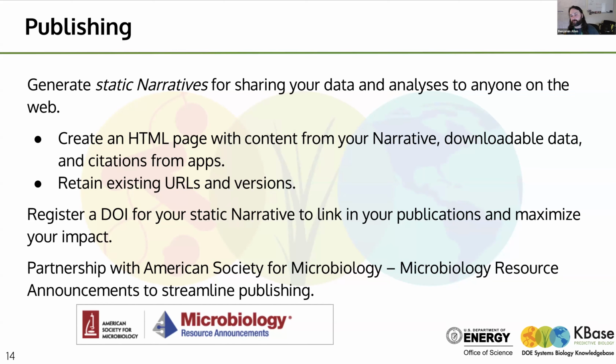And you can also register a DOI for your static narrative. Again, you may have results that you wish to share across multiple papers, or you may be trying to build your own collection, and so you want to have DOIs for your static narratives in addition to the DOIs for the paper that you've published.